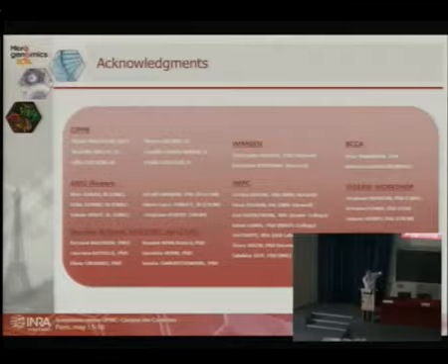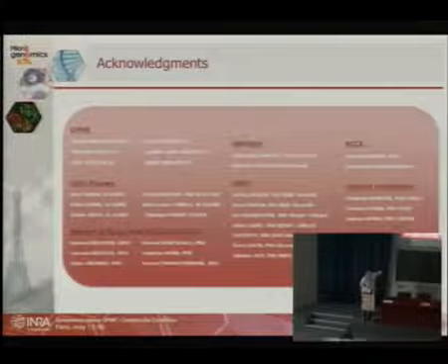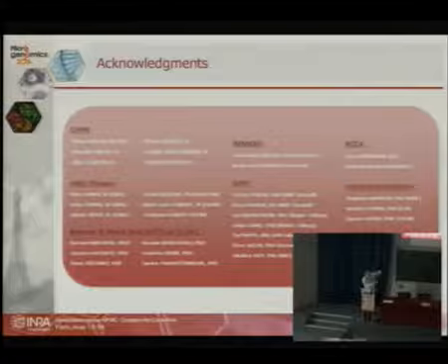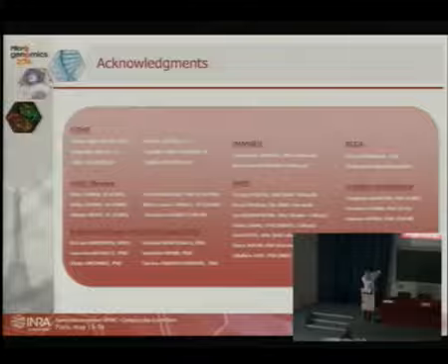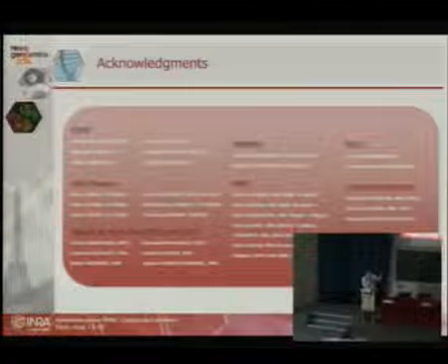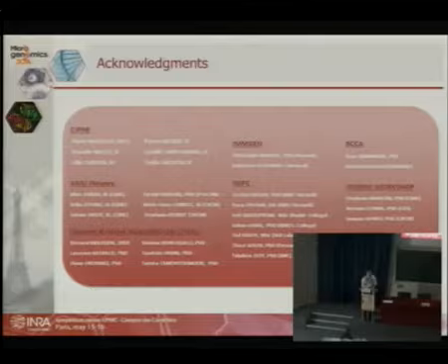People are also working on something even more complicated. If you define in your gating strategy, let's say, your first 5 markers, which are super specific to your lineage, then you can use that as a barcode for your staining mix. You can have a whole hierarchy of additional markers that maybe could be on other cells, but as your initial markers are in the one given cell subset, you are specific. Like this, you can recycle all the colors. That's the Sentinel approach, and you can reach 20, 30 markers at once. But that's complex.